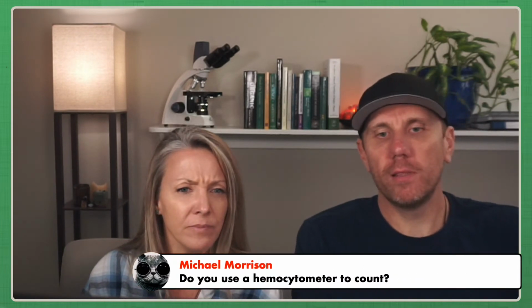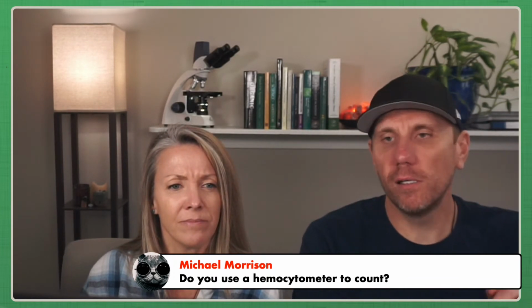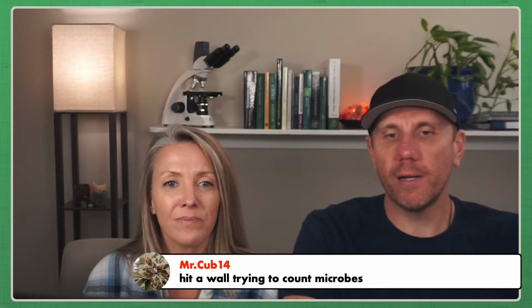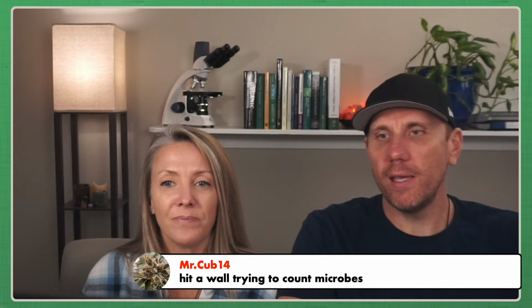I'm not sure what a hemocytometer is. Maybe break it down a little bit better in the chat. What we do is we use a compound microscope. Yep, there you go, right there. And we use the methods by Dr. Elaine Ingham for doing a quantitative, specific analysis that's quantifying very clearly what's in there, to get these numbers where we're measuring biomass. So it looks like Mr. Cub has a microscope and hit a wall trying to count microbes, which is why we're here today.